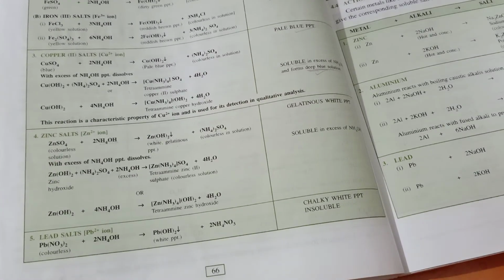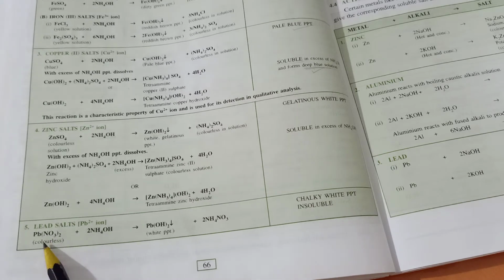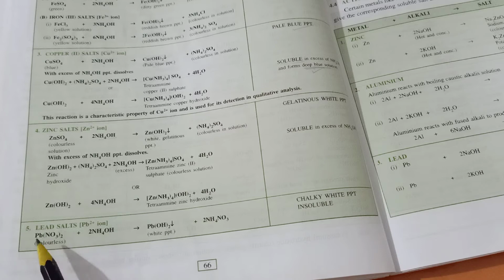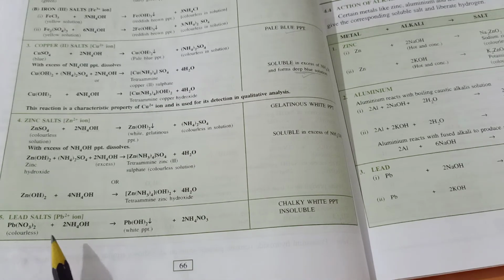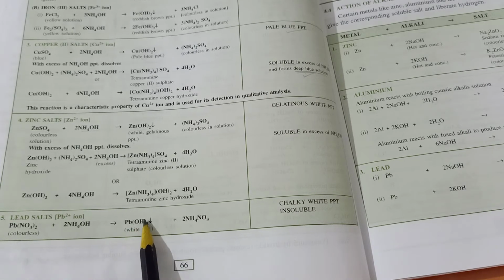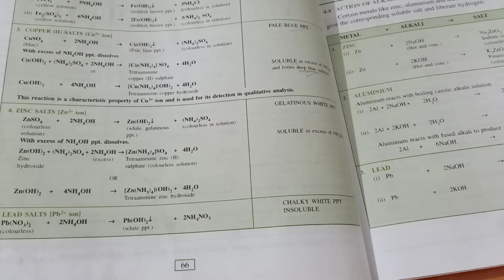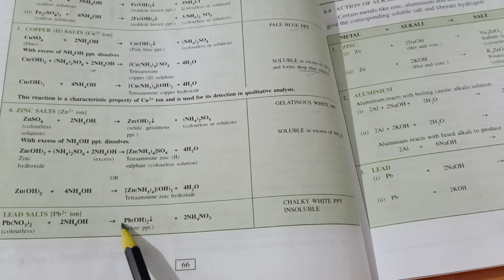Let's go to the last salt, which is lead salt. Over here we have lead nitrate, which is colorless because lead is a colorless cation. Now this lead nitrate also forms a white precipitate of lead 2 hydroxide, like sodium hydroxide was producing. But the difference over here is, with excess ammonium hydroxide, this white chalky precipitate does not dissolve.